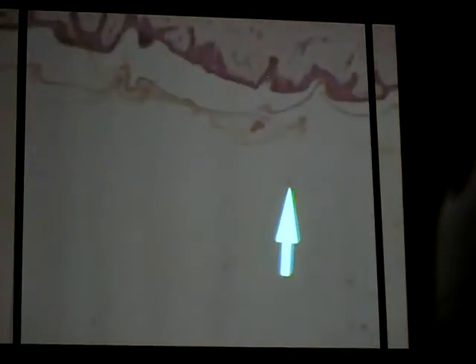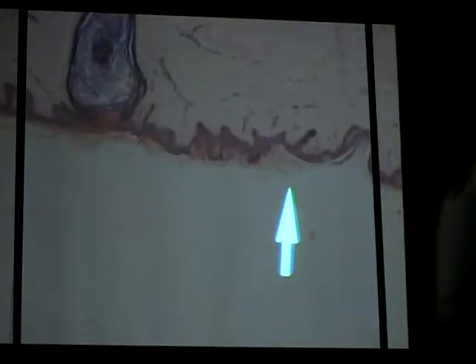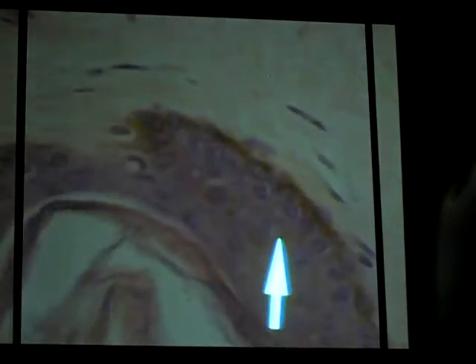Alright, then, let's take a look at the pigmented skin. Alright, so this is a slide of pigmented skin. So again, it's relatively thin skin because you're not seeing much of the keratin layer here. So with this one, the layers are not going to be as distinct as we saw in our thick skin. But we can identify a few of the layers here.